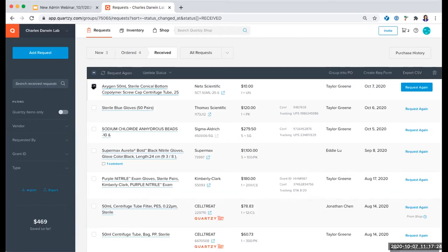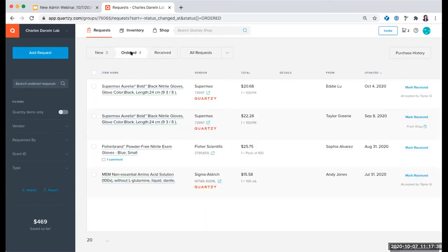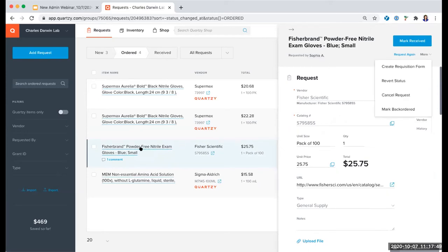A question came in: is there a way to edit an item that has been backordered and mark it backordered? Yes, absolutely. If you find out that one of your items is backordered, you would change that status under the More option. Click on the item name, go to your editing panel, and that's where you'll find Mark Backordered. That's also where you can cancel the request and a couple other options.